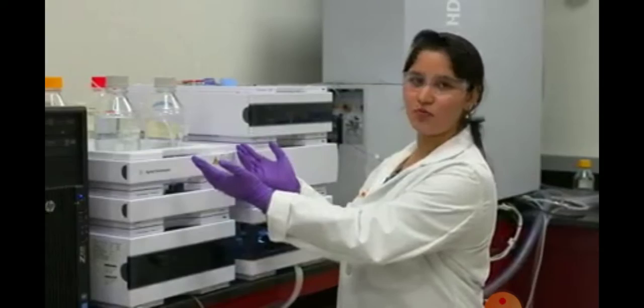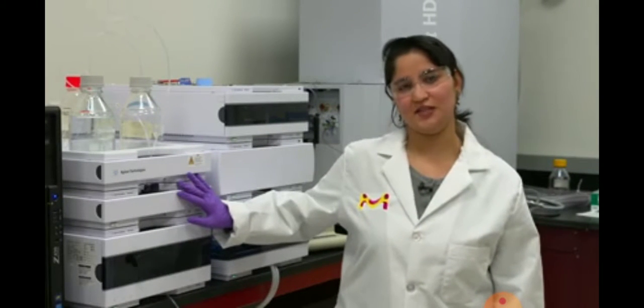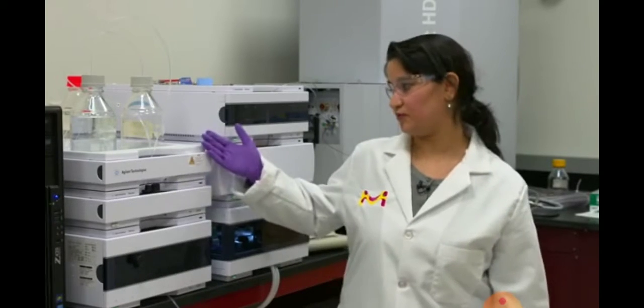One of the main components needed to run HPLCs are mobile phases. These are the different sets of mobile phases set up for HPLC that you can use to run your samples. And this is one of the types of HPLCs that we have here that we use with the mobile phases to accurately run your sample.